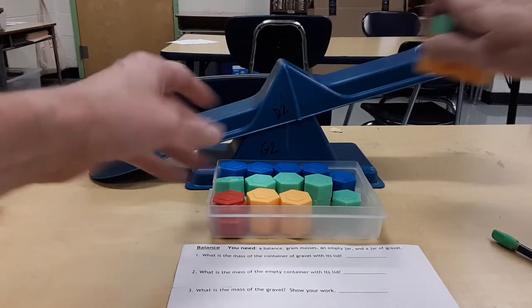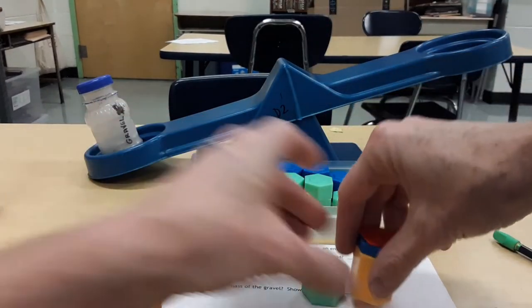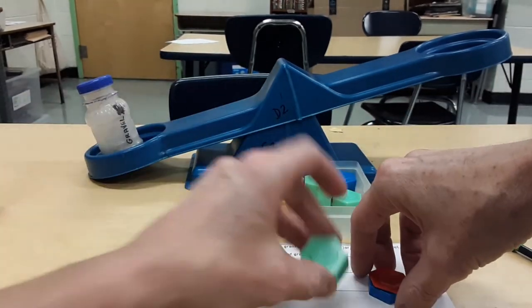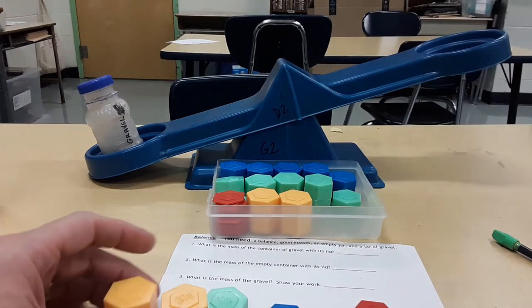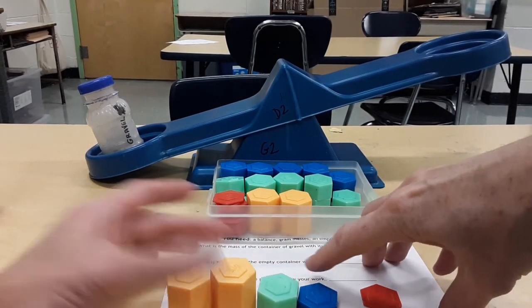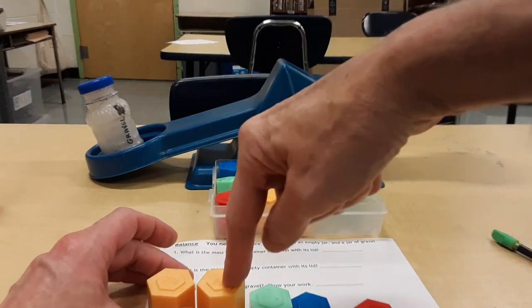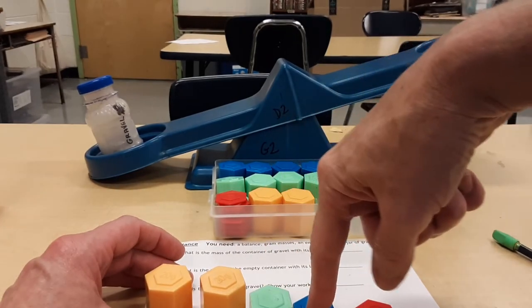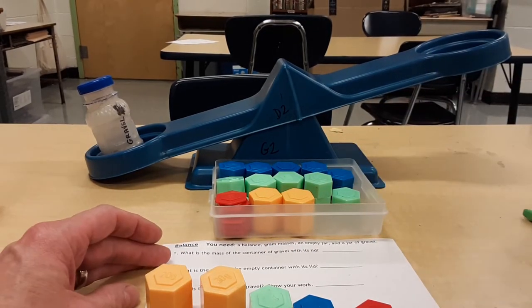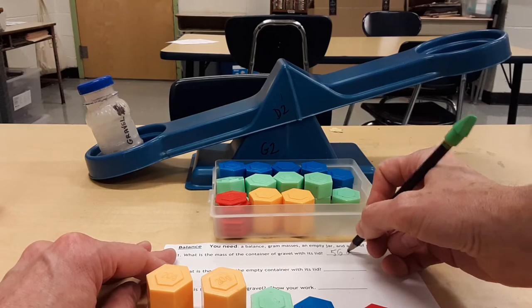Okay, so now my job is to add these up. This equals this because it's balanced, so let's add it up. The mass of this jar is 20 grams plus 20 plus 10 plus 5 plus 1. So, here we go. Again, what is the mass of the container of gravel with its lid? It equals 20 plus 20 plus 10 plus 5 plus 1. 20 plus 20 is 40, plus 10 is 50, plus 5 is 55, plus 1 is 56. The answer is 56 grams.